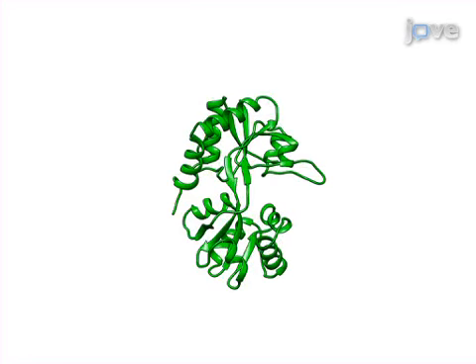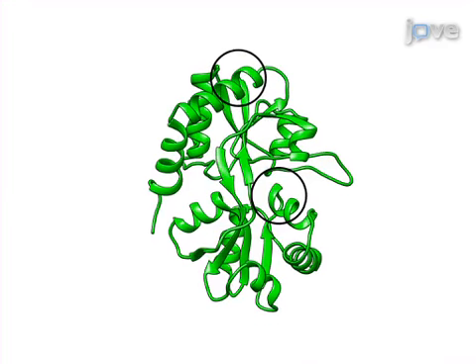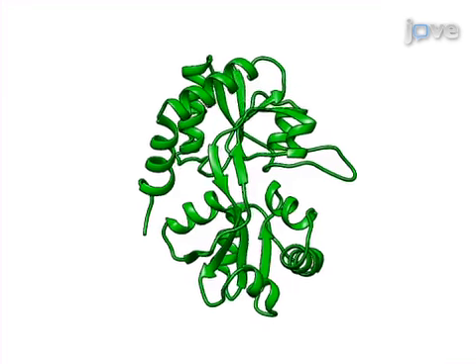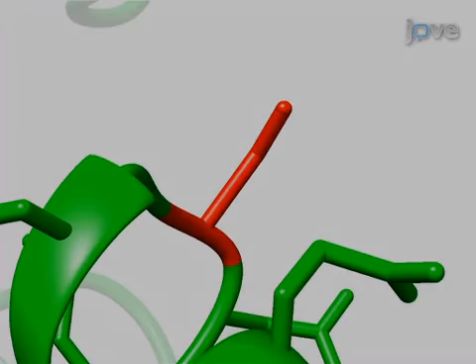Before starting the experiment, it is important to choose labeling sites that are able to reflect the possible conformational changes within the protein. If possible, use the crystal structure of the protein or of a homologous protein to help make this determination. Choose residues such that the side chains of the selected residues are surface exposed and accessible to the fluorophores so that the protein can be labeled.